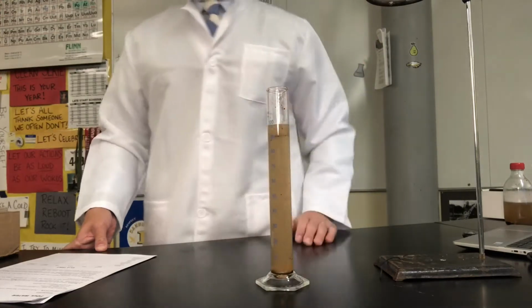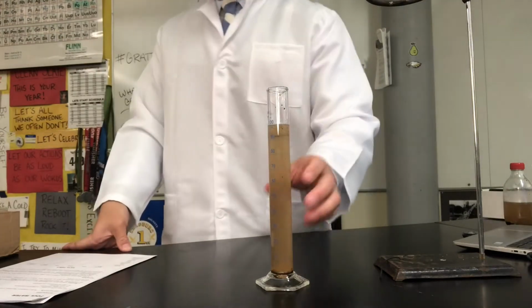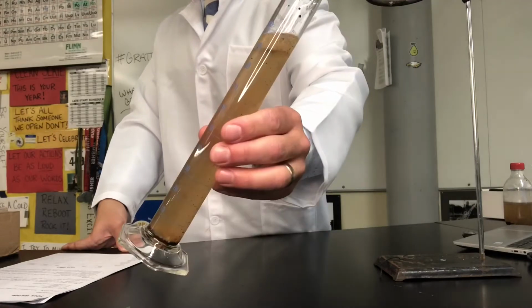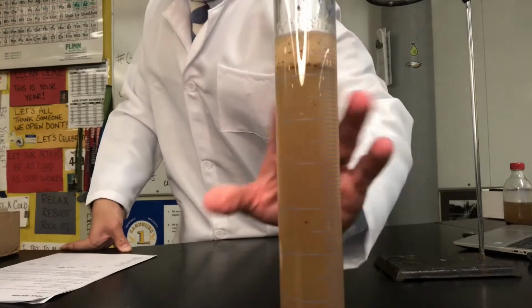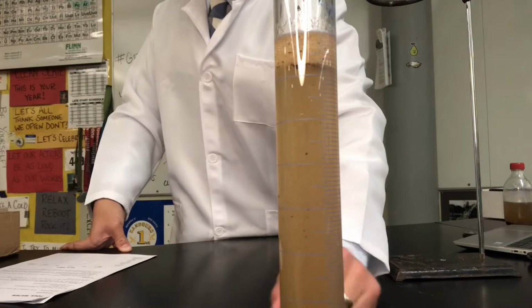Now, when we're making observations, we want to make sure we write it in a way that people understand. So I would definitely say that this is a light beige or a yellow in there. Okay, so go ahead and write that down. As far as clarity, take a look. It's not very clear, right? It's cloudy. So let's write that down as cloudy.